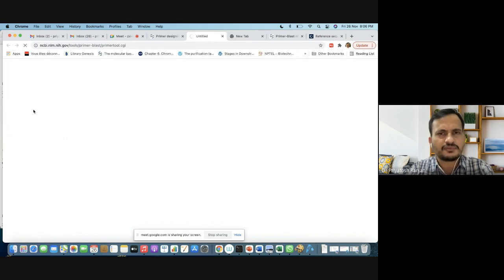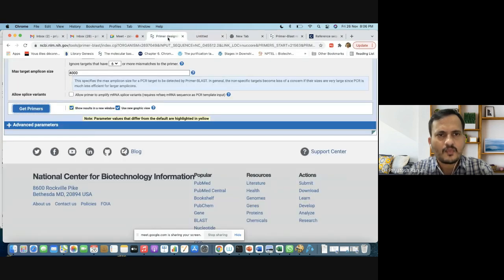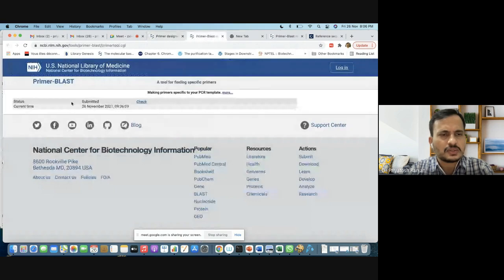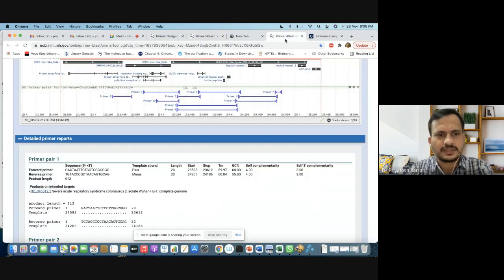It's going to take a few seconds. So it's suggesting that it's submitted, and it's going to take a few seconds. I've already done it for you, so I'll just come back to the results part.